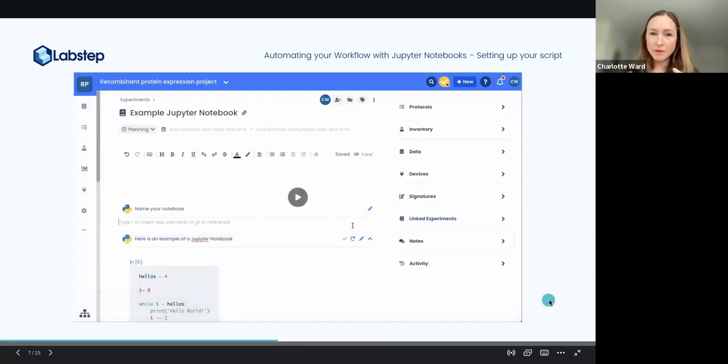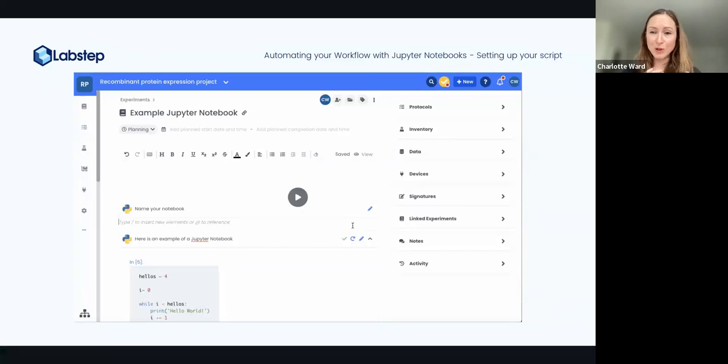Are you? So actually, sorry, this is something we maybe should have clarified right from the beginning. Because this is a premium feature, it's not switched on for everybody right now. If you can't see it and you want to see it, or you think you should see it, please get in touch with us because we can sort this out. Amira, you probably have more to say on that.